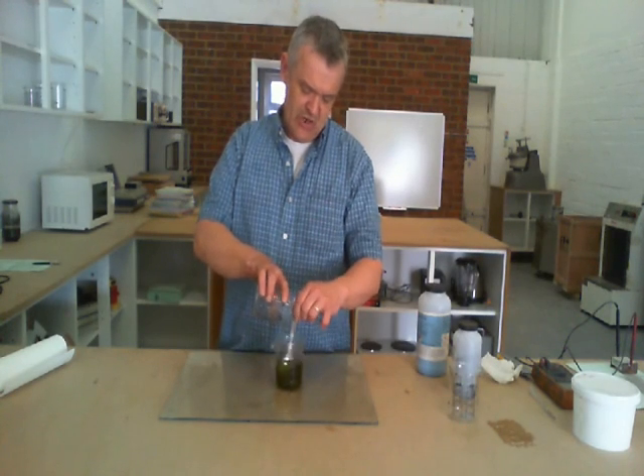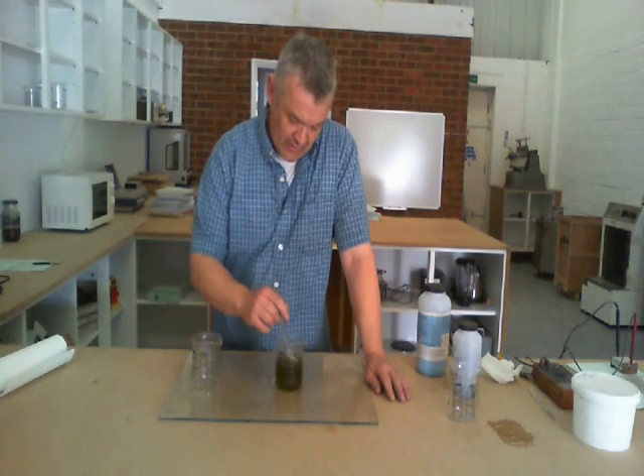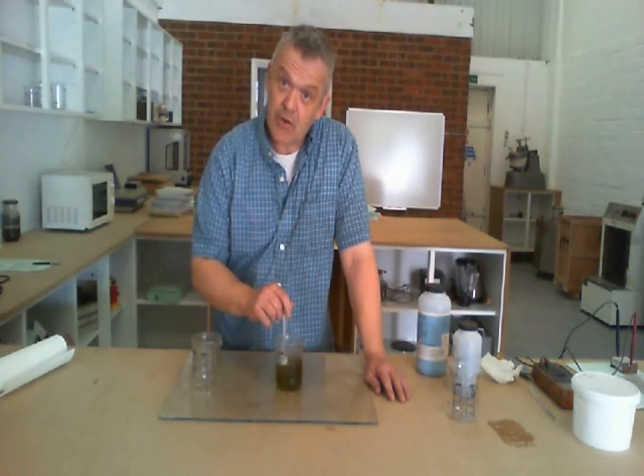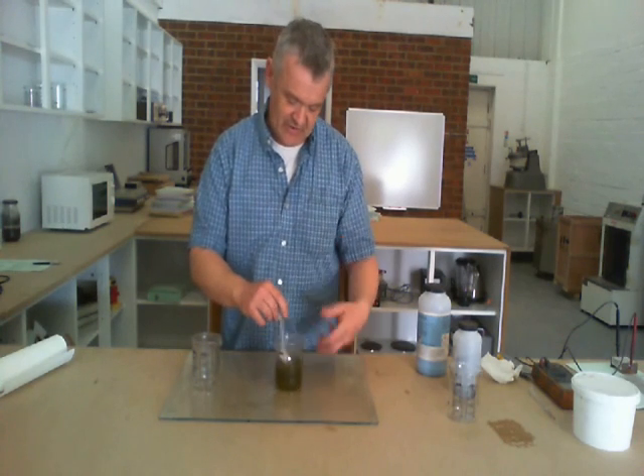And as you add it and continue stirring, you'll get a coppery coloured solution that has a hint of green behind it.